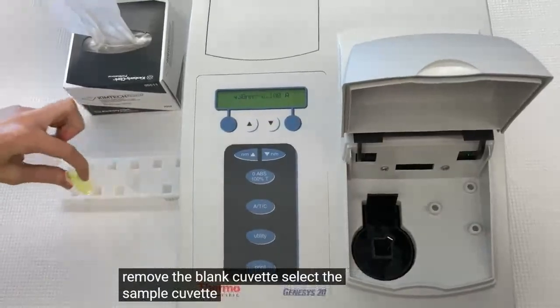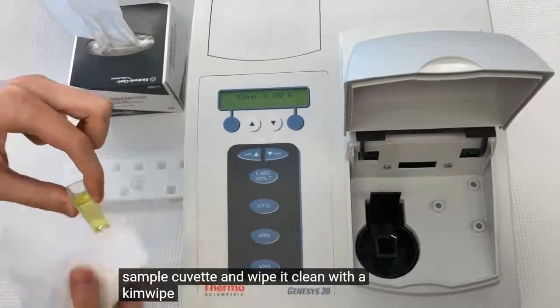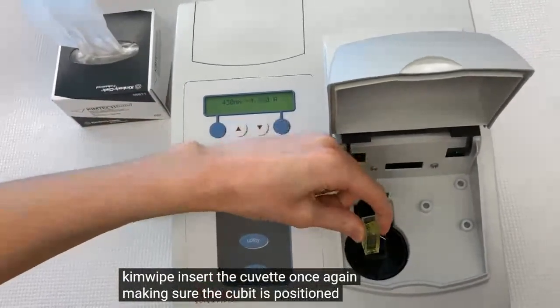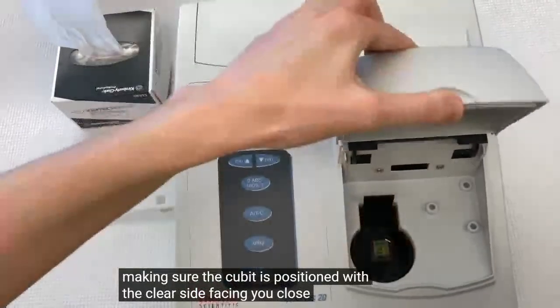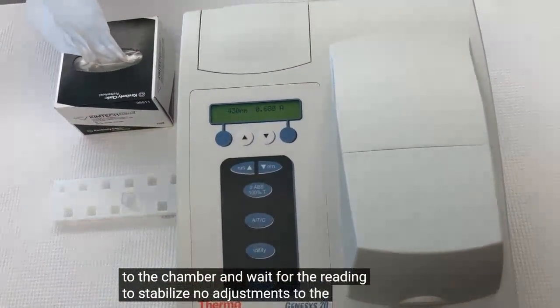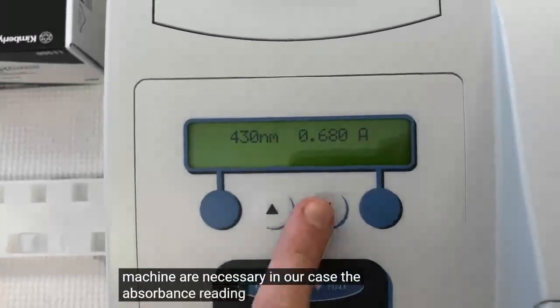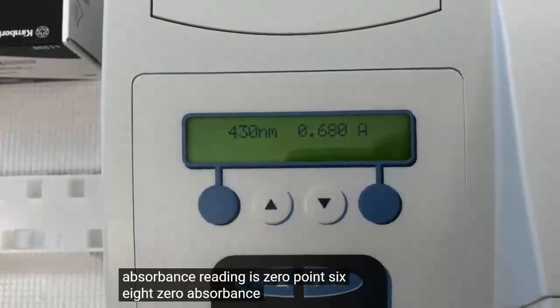Select the sample cuvette and wipe it clean with a Kim wipe. Insert the cuvette, once again making sure the cuvette is positioned with the clear side facing you. Close the lid to the chamber and wait for the reading to stabilize. No adjustments to the machine are necessary. In our case, the absorbance reading is 0.680. Absorbance does not have units.